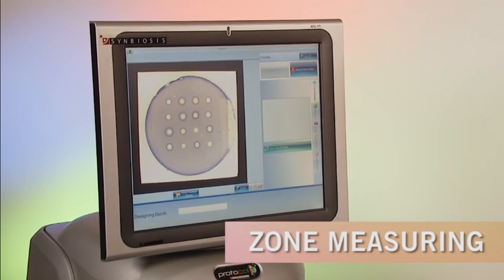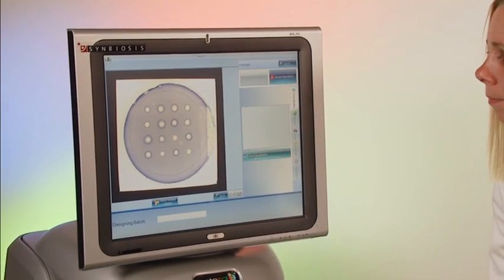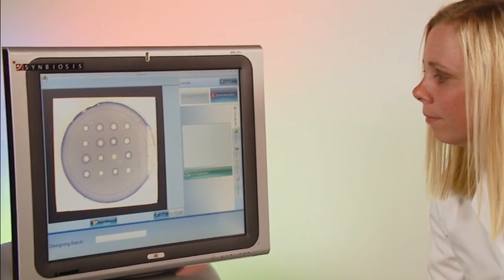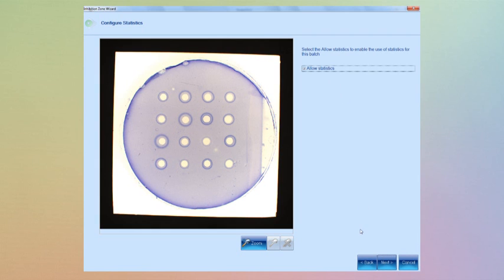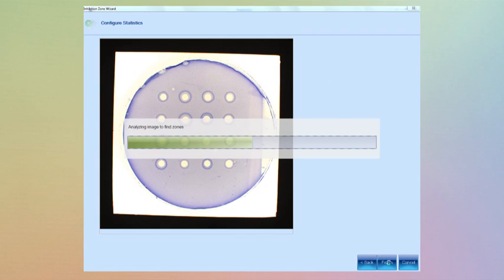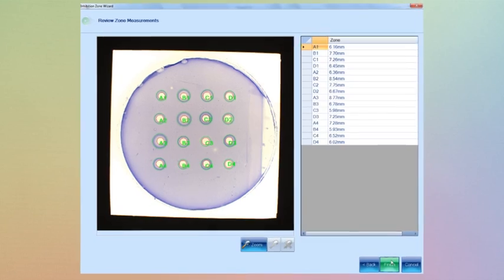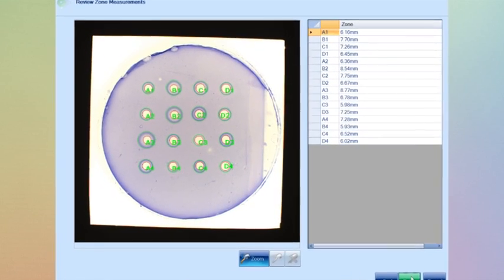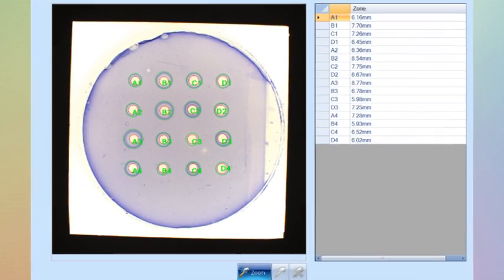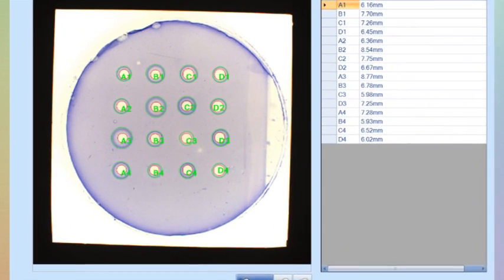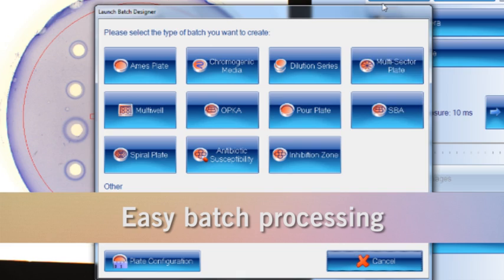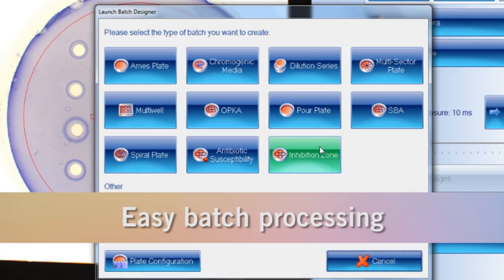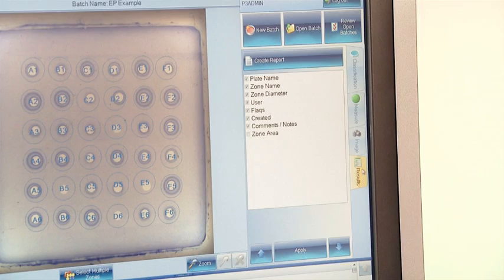As a zone measuring system, Protocol 3 is equally capable and versatile. In this typical pharma application, vaccine potency testing is made simple and accurate. Batch processing is also easy to set up.